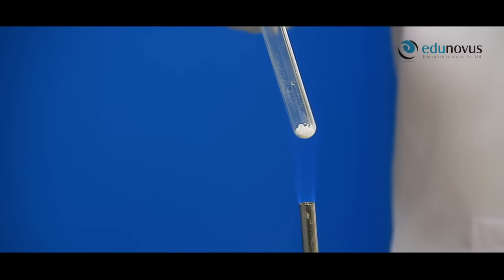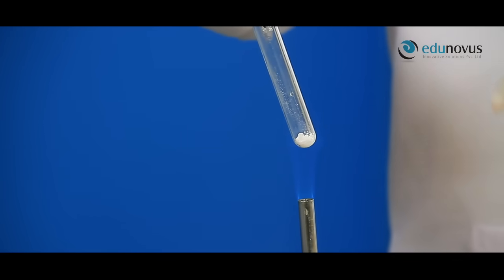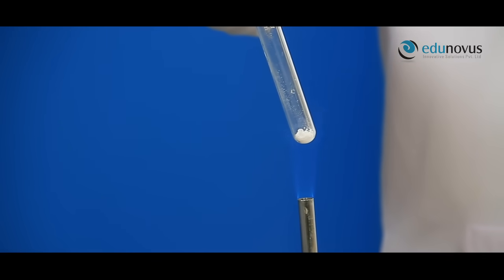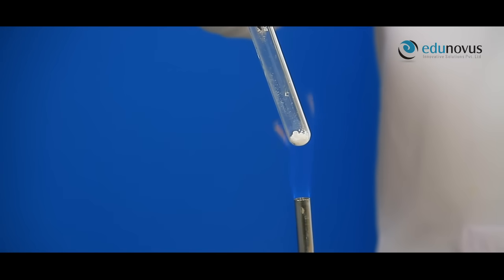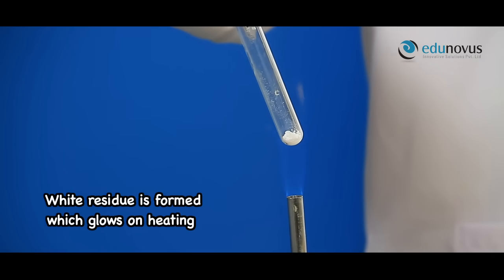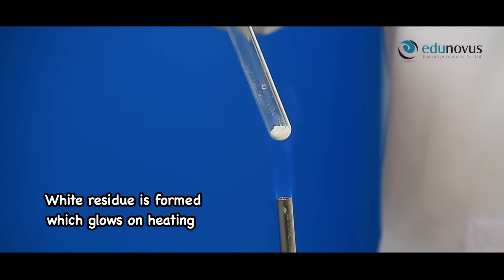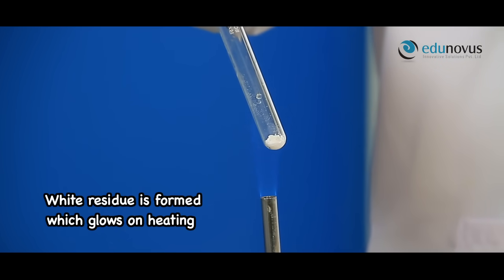Here you can clearly see that this residue is glowing slightly. This test infers that the given salt may contain magnesium, calcium, strontium, barium or aluminum cation.